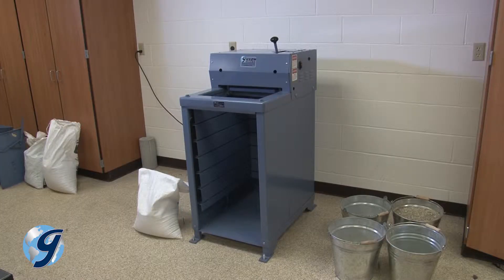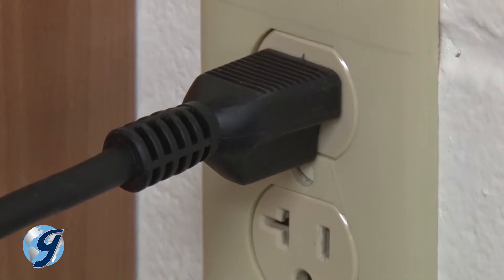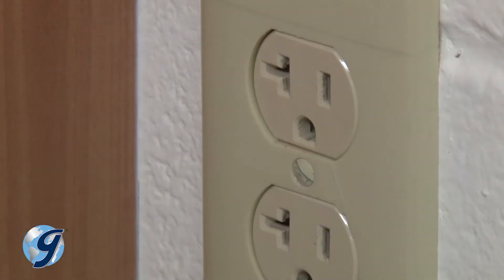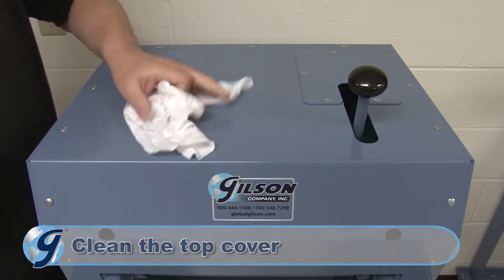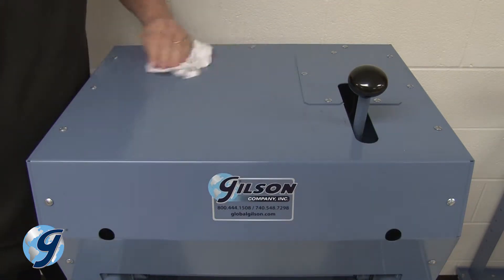To check the hydraulic oil level on your testing screen, you first disconnect the unit from its power source. Be sure the top cover is clean to prevent foreign material from falling into the pump and contaminating the oil.